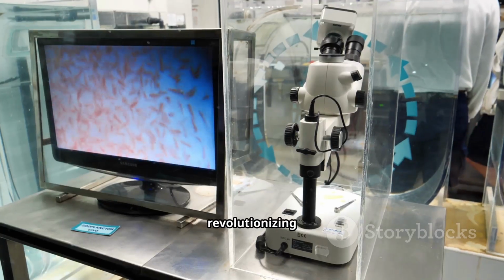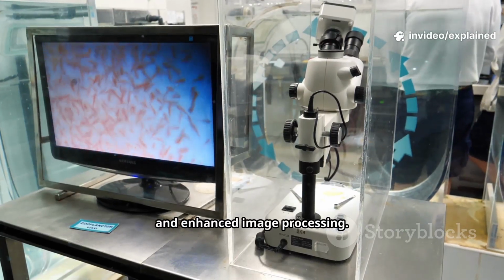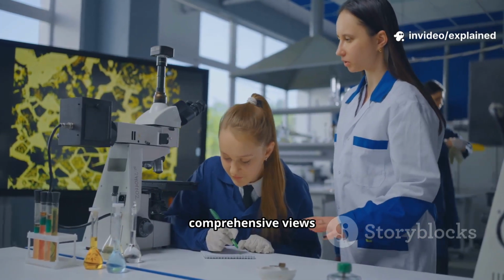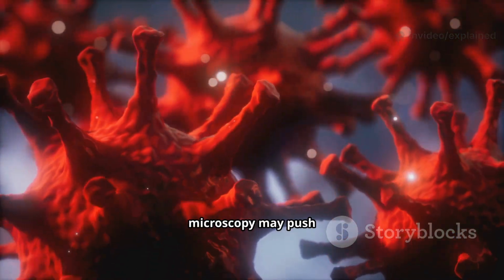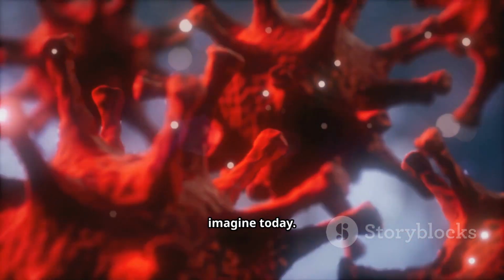Artificial intelligence is revolutionizing microscopy with automated analysis and enhanced image processing. Correlative microscopy combines multiple techniques to provide comprehensive views of specimens. Future quantum microscopy may push the boundaries even further, revealing details we can barely imagine today.